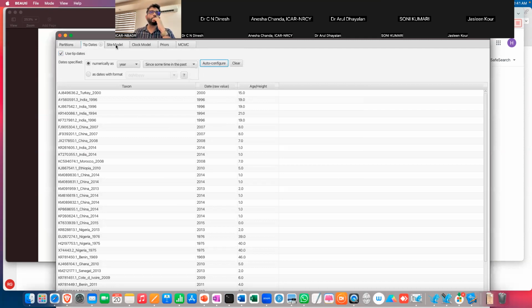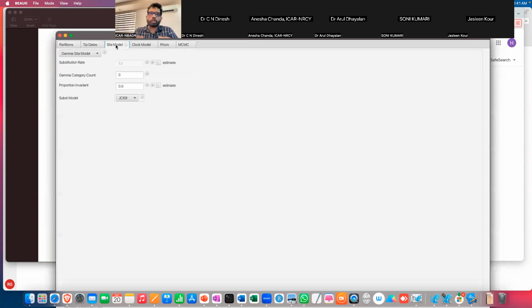Now, what I tell you here is, the normal BEAST is run by selecting the model here, JC69. We are not running JModelTest 2. It's a piece of cake, guys. I have a set of screenshots. Just run it. You can finish it up. We're not going to waste time on that.